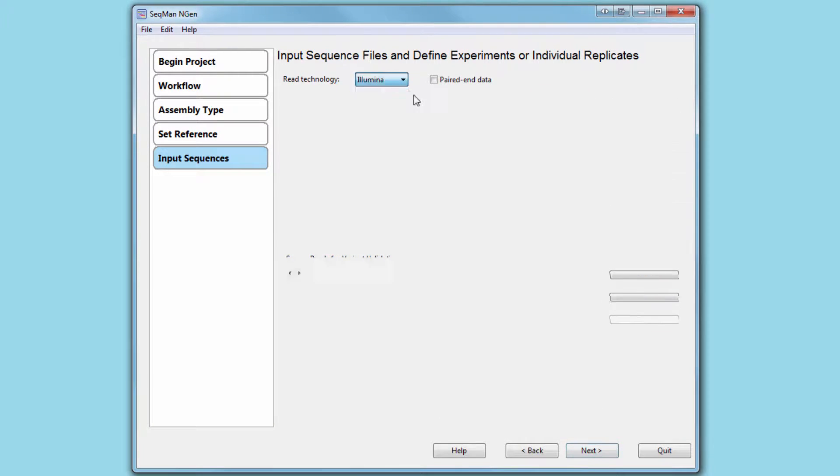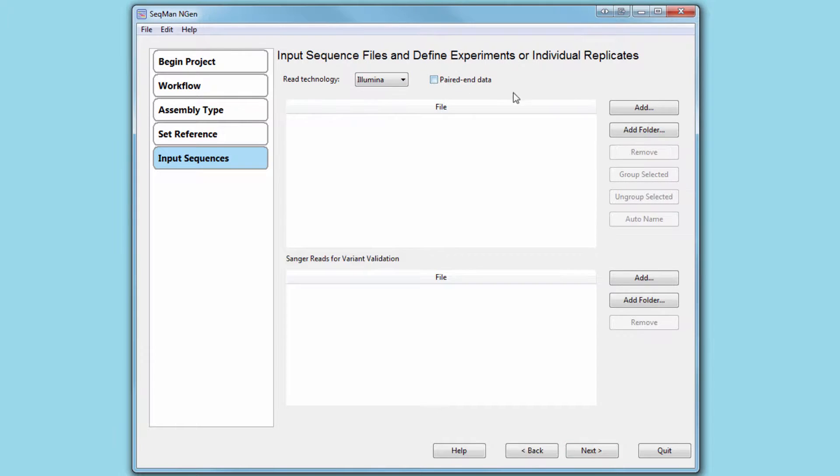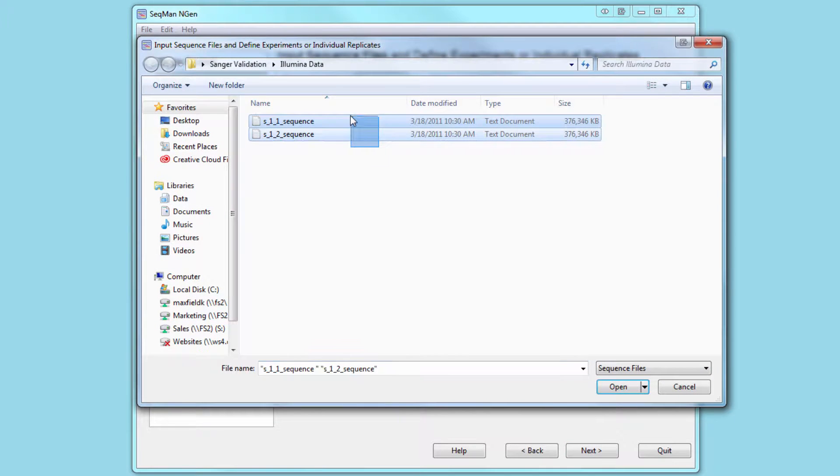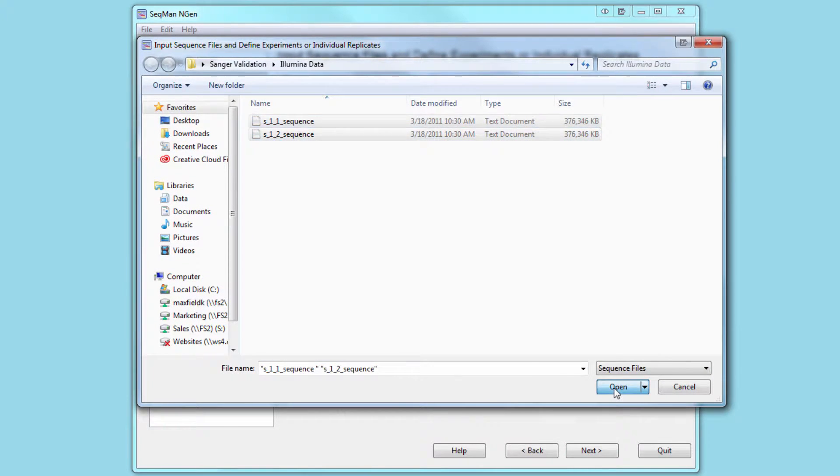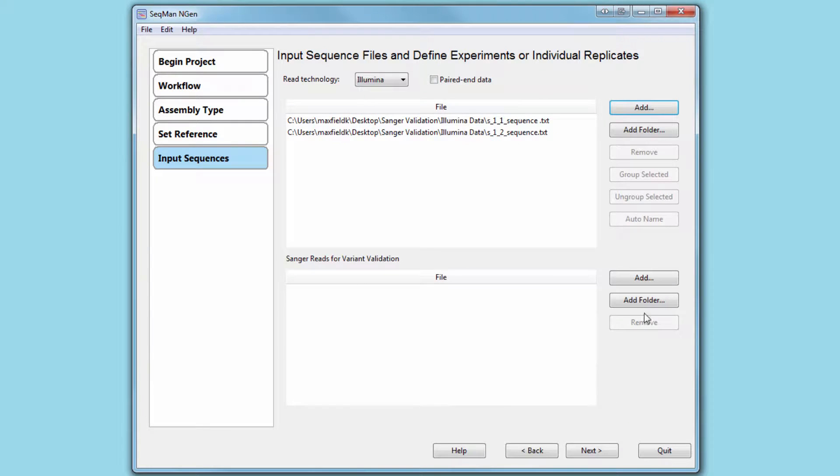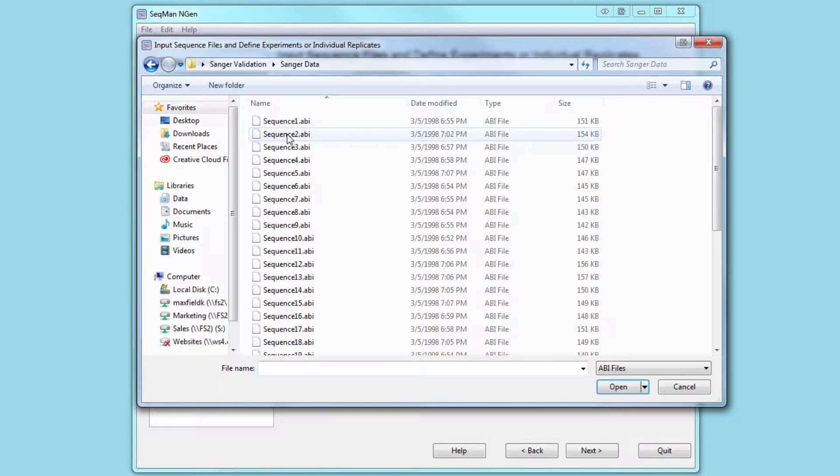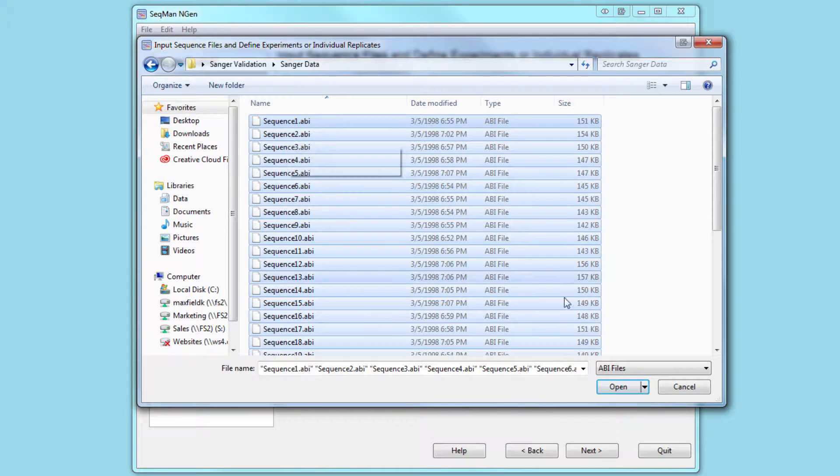Now, select your next-gen read technology and load those reads. And on the same page, load your Sanger reads.